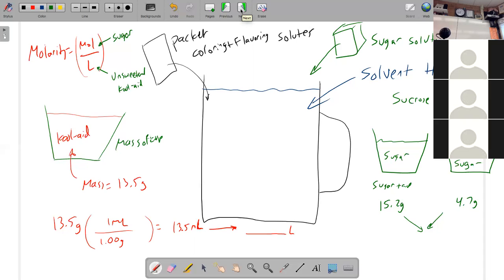Everything is safe to eat and drink, and you don't need goggles as long as you don't put in anything else besides what you need.